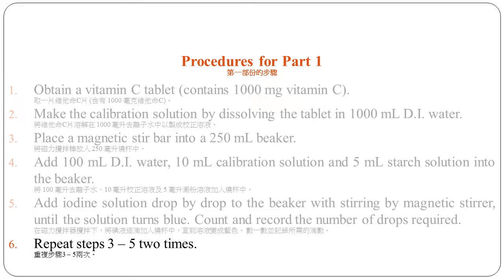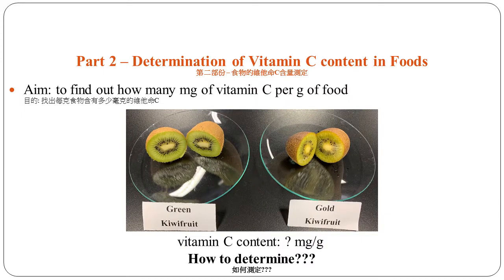Now, we finished the first calibration. In order to make the results more accurate, we will do 2 more calibrations. Let's repeat steps 3 to 5 2 times. Now, part 1 has been finished.